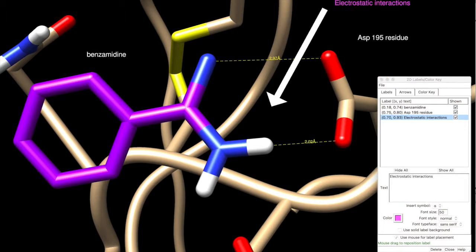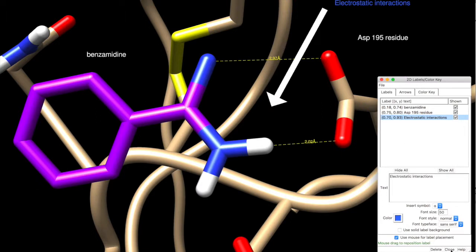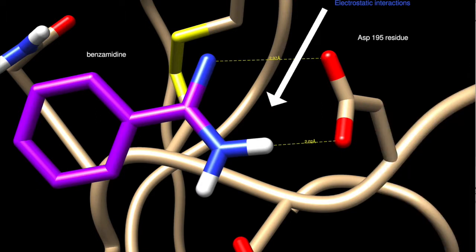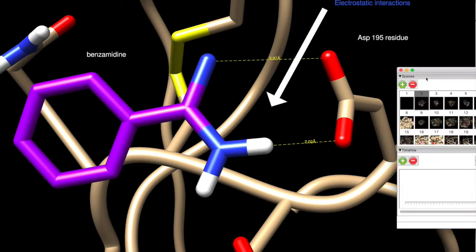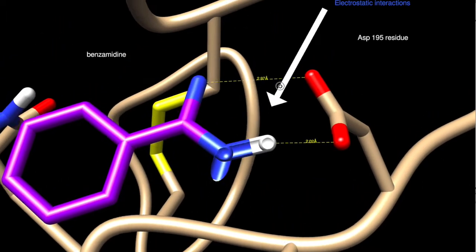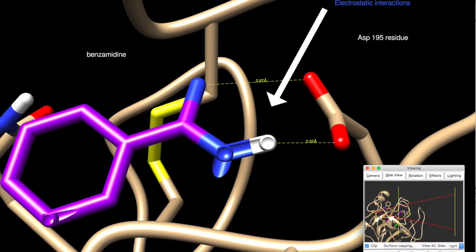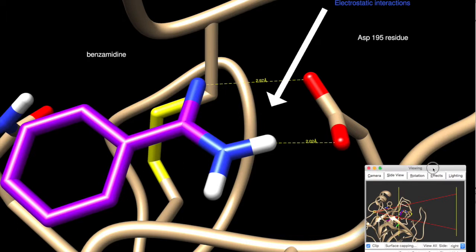This time I want this label to be different color. So I will use color editor to create that. Once I'm happy, I will close this dialog and I can show this in my scene. Okay, I can move it a little bit, but now it went out of the plane, so I need to move this cut line. Very good. And create another scene. All right.